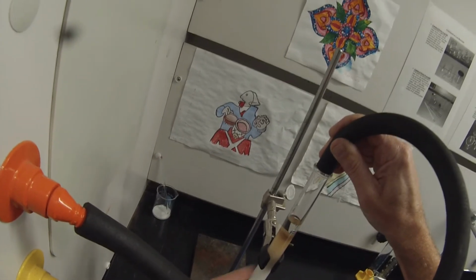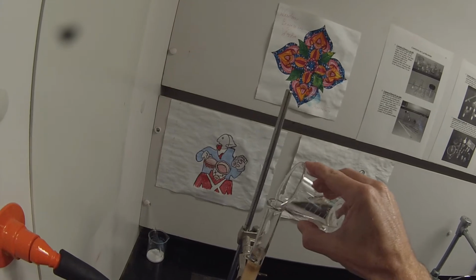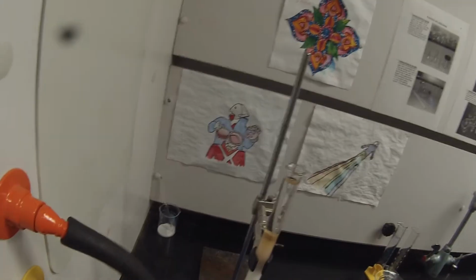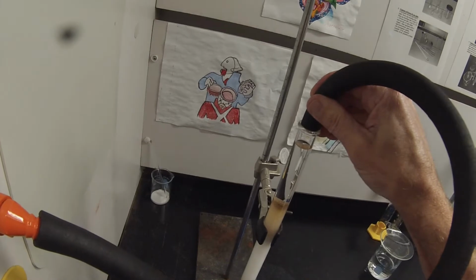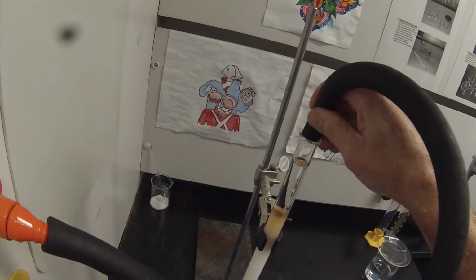And scoot that over, but I do have to make sure I don't let it go dry. So just release the pressure. And if you release the pressure slowly, you don't get air bubbles. If you release it too fast, that little crack there is going to explode upwards. And that would be bad for business. I'd get lousy separation. And if I don't get great separation the first time, I can always run another column.